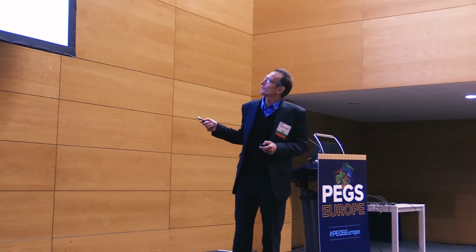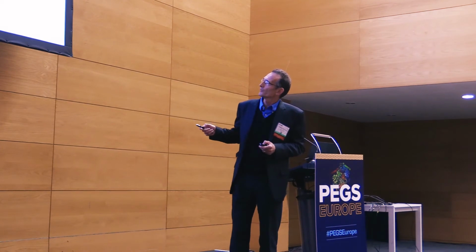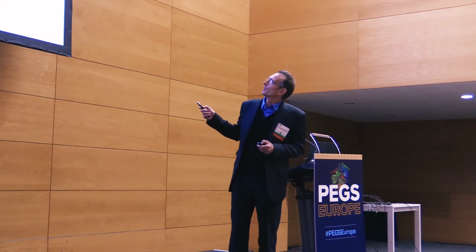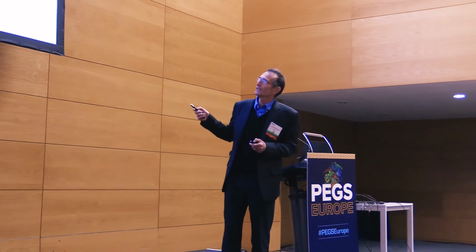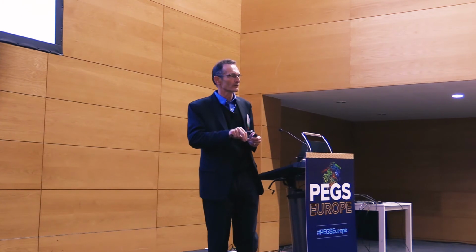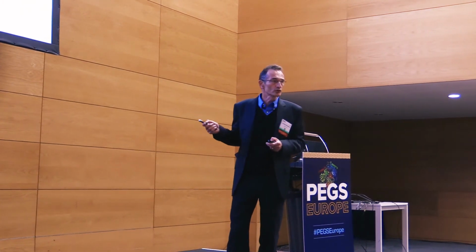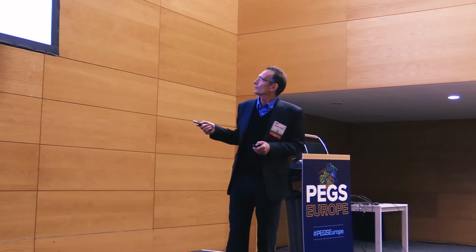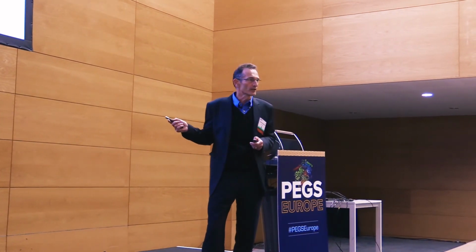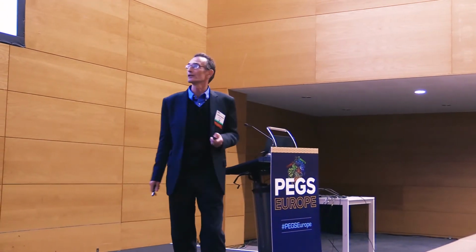Looking at the diversity of these libraries, this was our Gen 1 library. This is our Gen 2 library. This is from a single donor. This is from 15 donors. And this is our Gen 3 library. And what we have here is about 200 million measured CDRs. So this is not an estimate of diversity. This is a measure of diversity. How much clonal dominance do we have? Well, very little. You can see that the most abundant VH in the library is 0.005%. So we're not seeing large numbers of clones that are dominating this library.